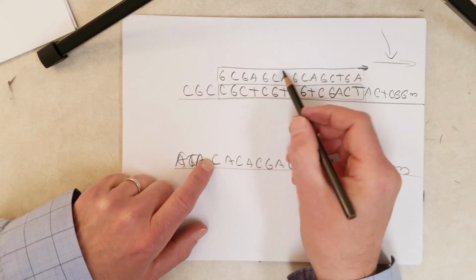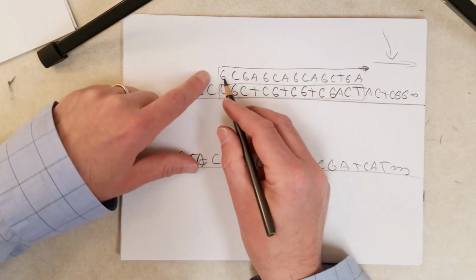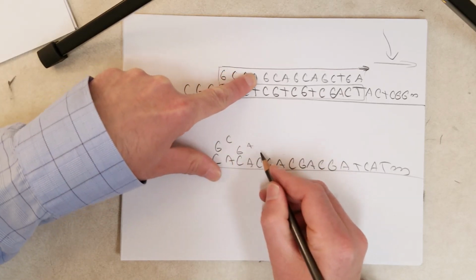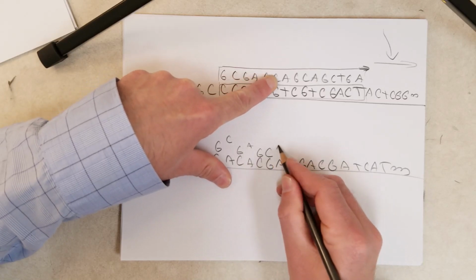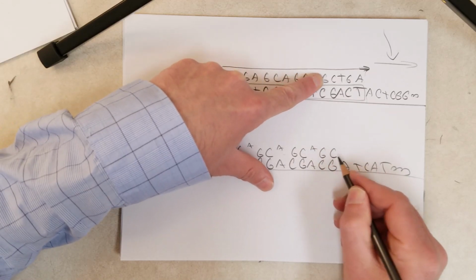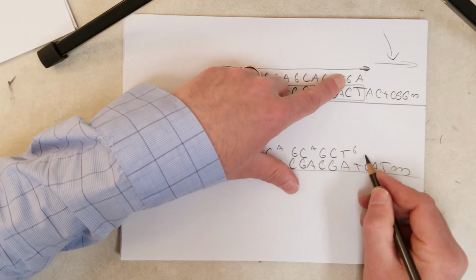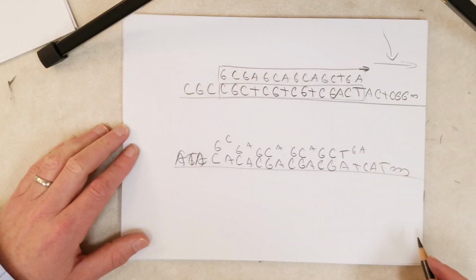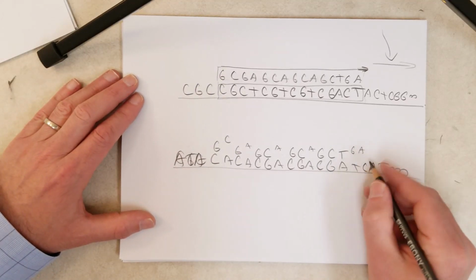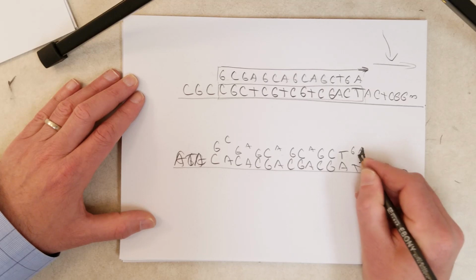Now, okay, if we choose an annealing temperature that's too low, well, this primer right here kind of matches this a little bit, right? This G can go here. Well, the C won't fit, but the G matches. The A doesn't match. This G matches. The C matches. This A does not. This G does. The C does. A does not. G does. C does. T does. This G doesn't. This A doesn't. Let me see here. Well, I want this last one to match, and there are reasons why you want the last one to match.